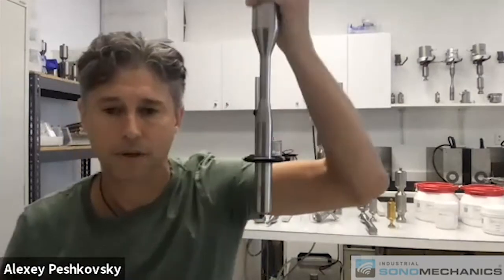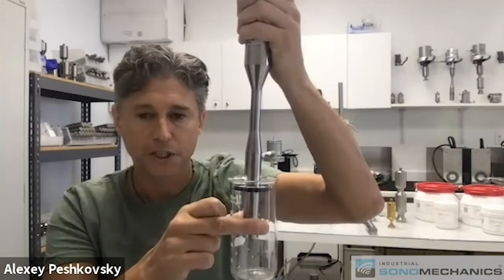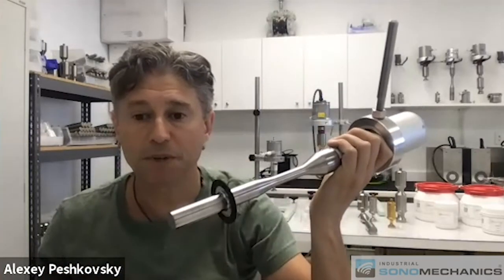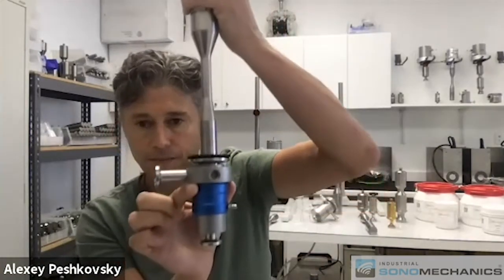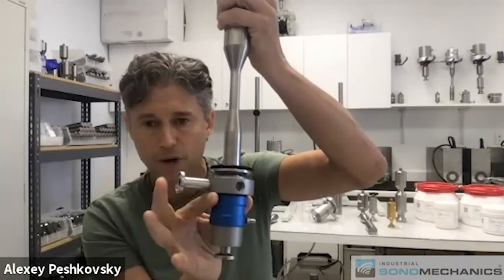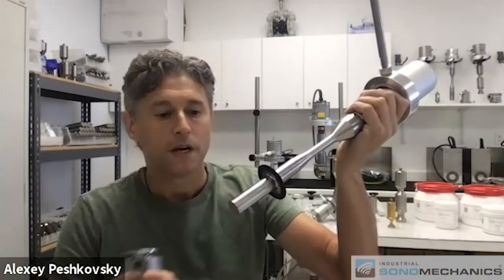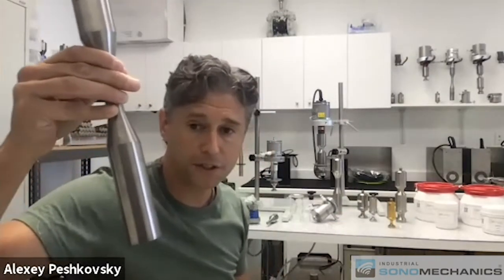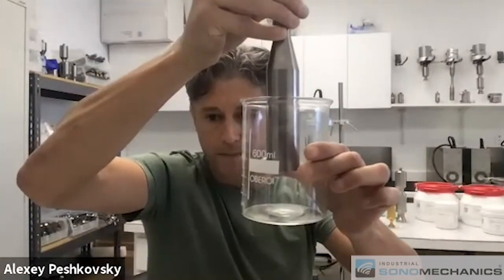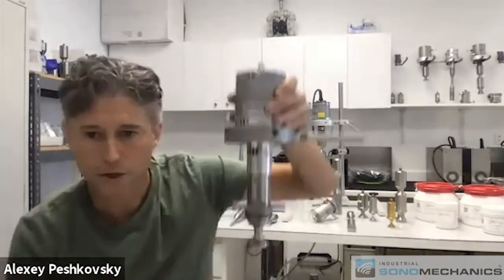The first scale-up step would be to go to these components from our LSP 600 ultrasonic system. Alternatively, you can use a reactor chamber like this and flow the liquid in through the bottom and out the top, going into a larger storage tank. The size of this tip basically determines the productivity rate. This is a horn from a BSP 1200 system — a typical beaker for it would be this size, but people using BSP 1200 units typically go through flow-through scenarios.